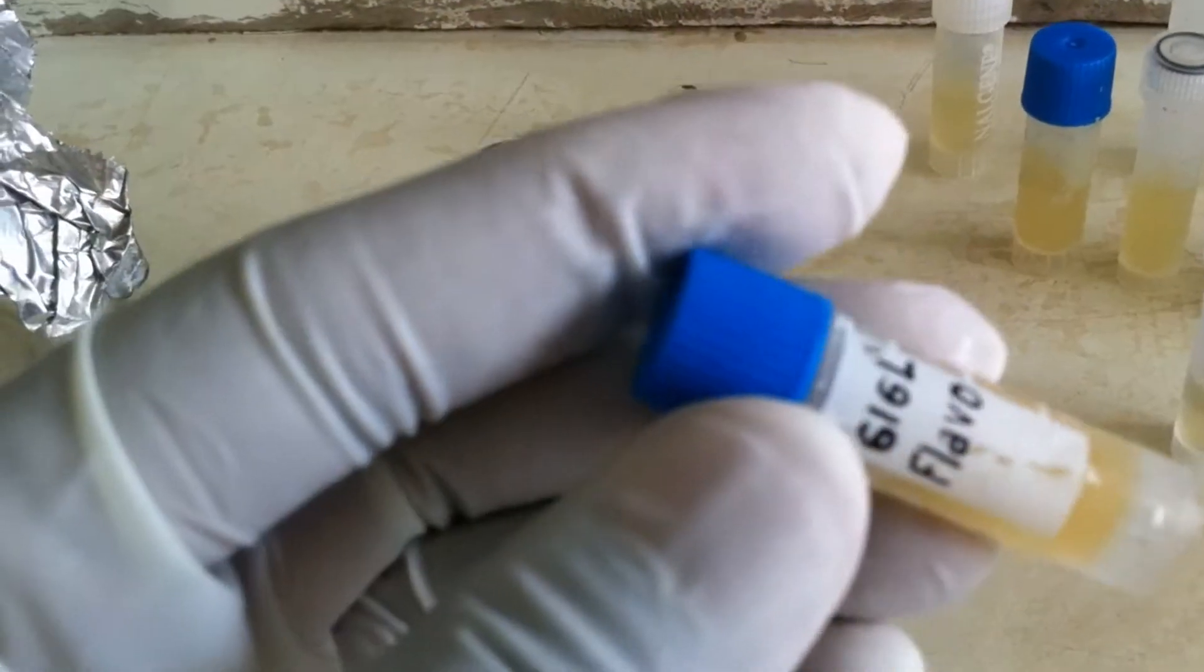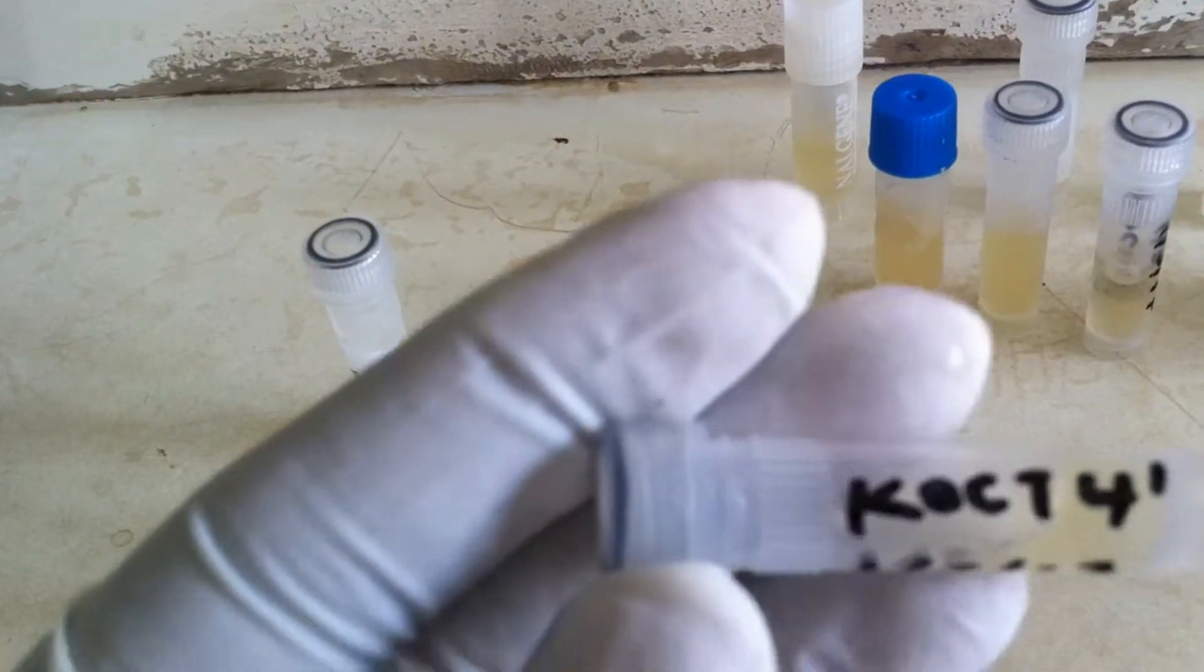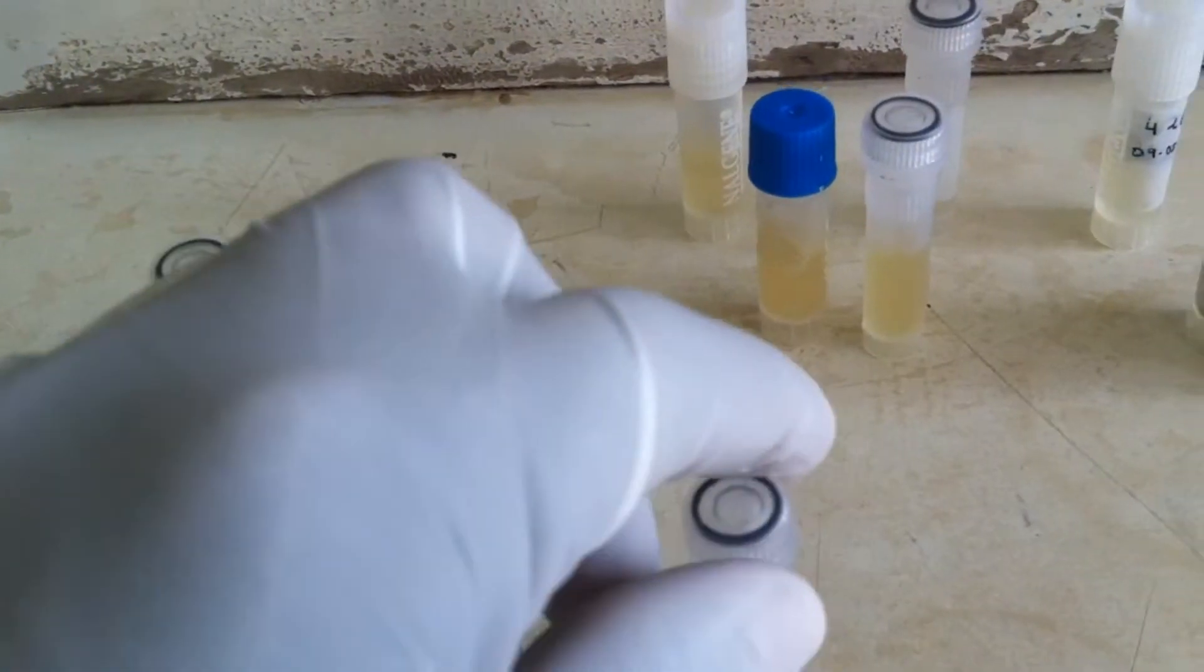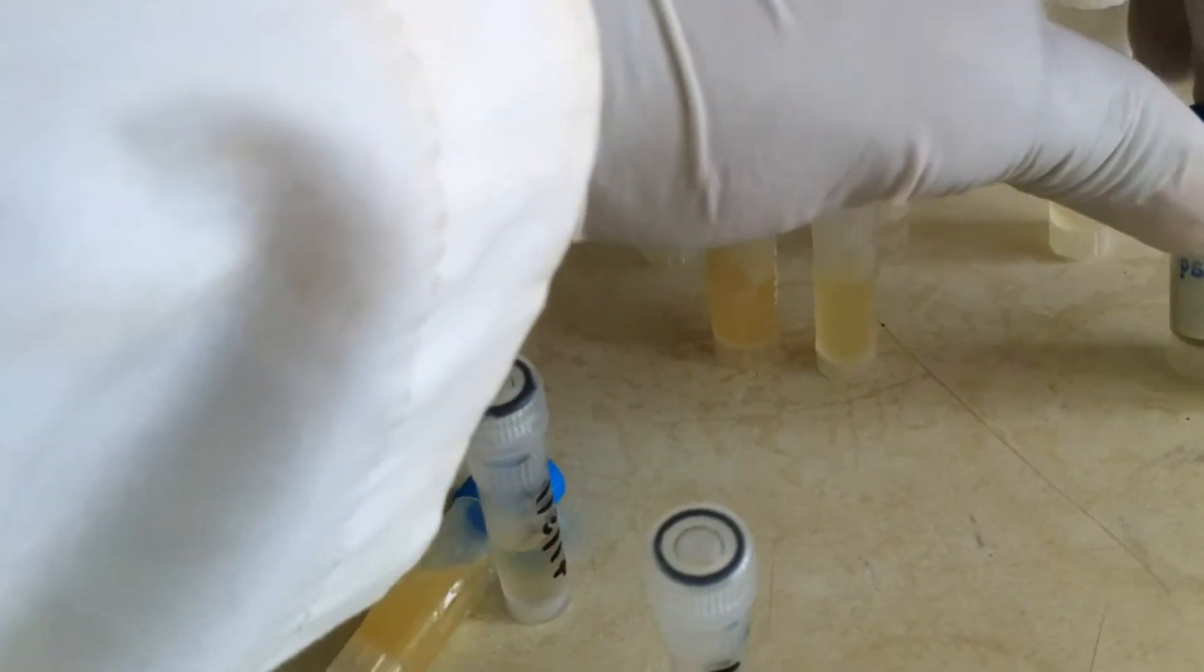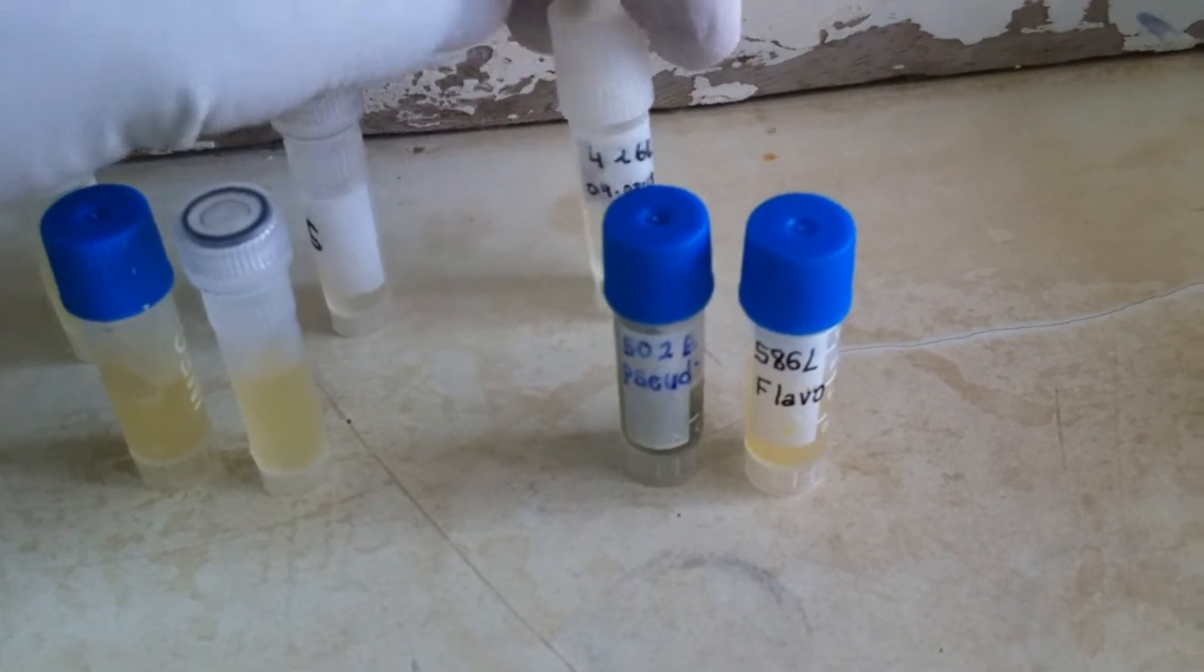Edwardsiella, Pseudomonas, and Aeromonas. Some of these bacteria you will see are just labeled as numbers. We call these laboratory numbers. When you proceed with our work, you will see the real identity of these bacteria. It's used just to identify inside the laboratory.